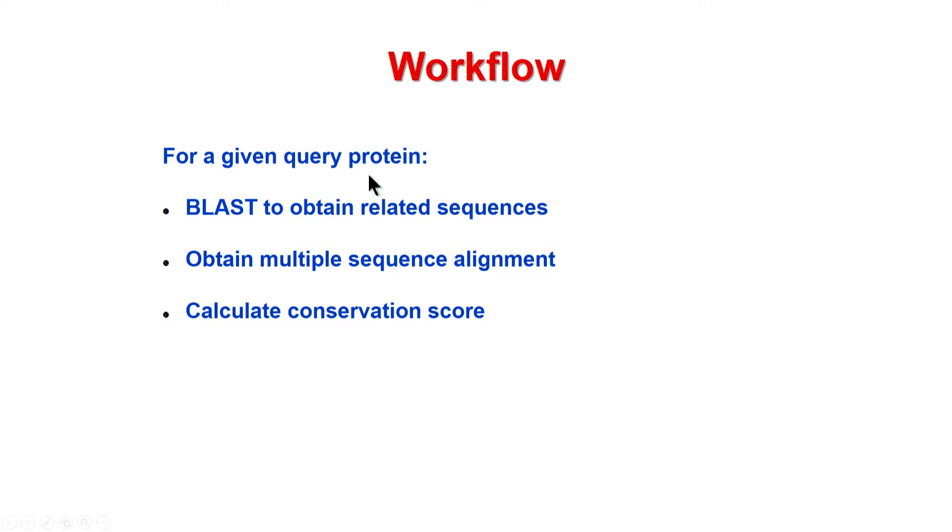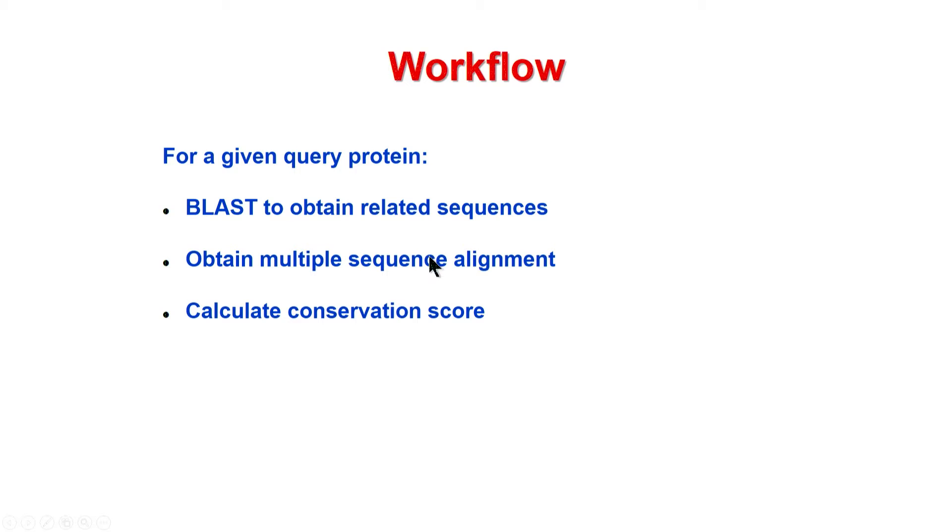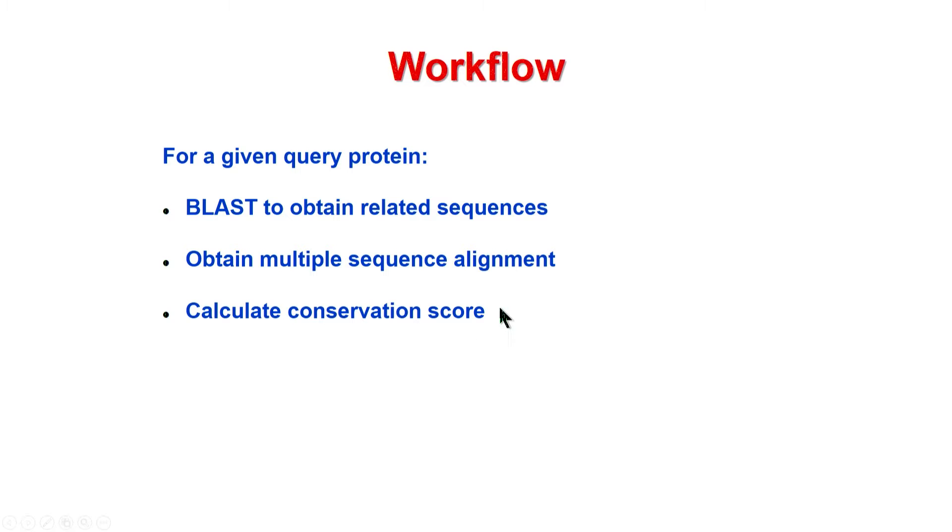We take any query protein, for example myoglobin. We will explain how to use BLAST to get the related sequences. From the output of BLAST, we use ClustalW to get the multiple sequence alignment. The results will be used as input to AL2CO and we obtain the conservation score. Let us see the details how to utilize these tools.